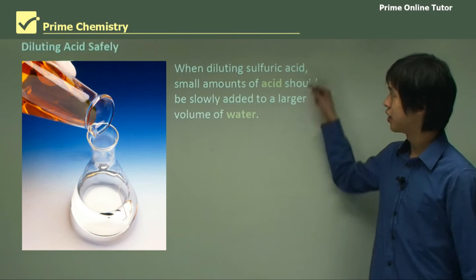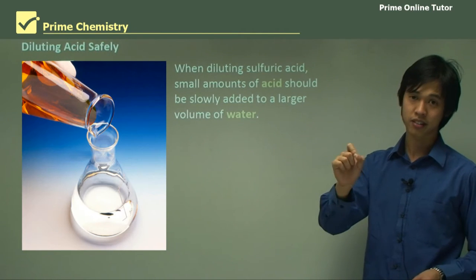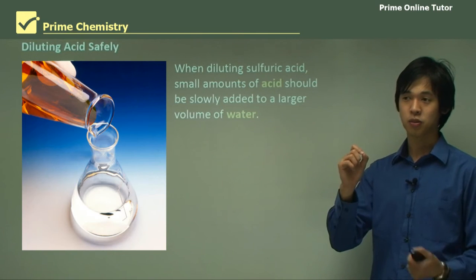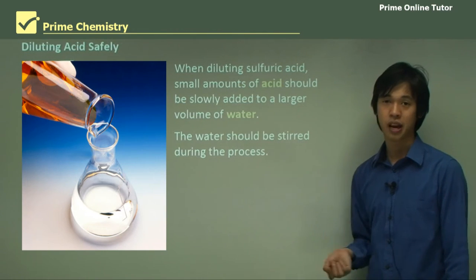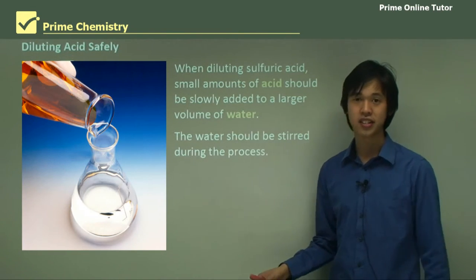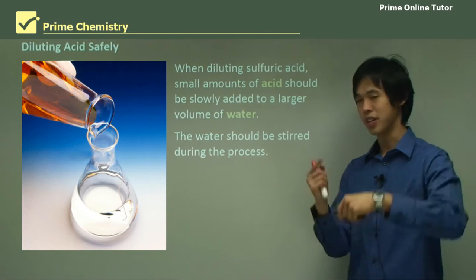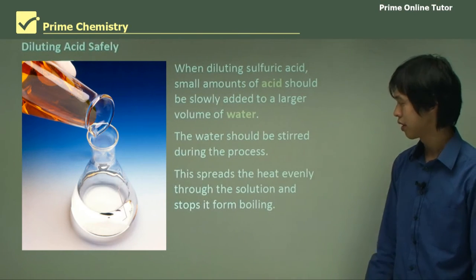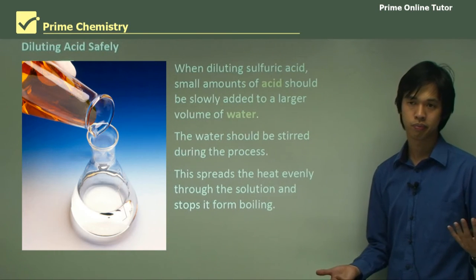So what do we do to keep dilution safe? We only add small amounts of acid to a large volume of water — tiny drops of acid into big volumes of water. The large volume of water can absorb the heat and won't boil, and the small amount of acid won't cause any splashing. The water should also be stirred during the process so the heat doesn't build up locally in one area but is evenly distributed through the beaker or flask, which stops it from boiling.